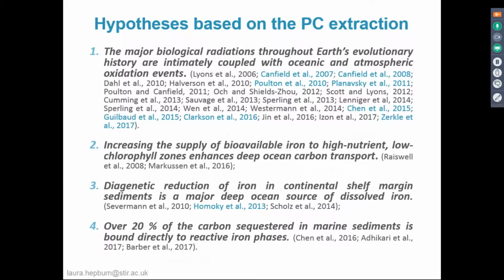Now, this technique has been used extensively in many high-impact studies throughout ocean and earth science, mainly to reconstruct early ocean chemistry and describe the major radiations in Earth's biological evolution, and also to describe major processes in oceanic carbon cycling.